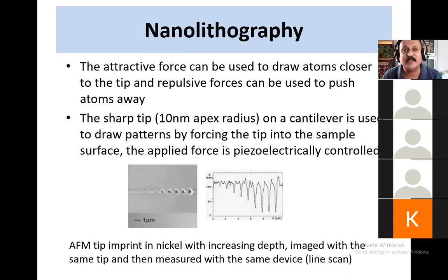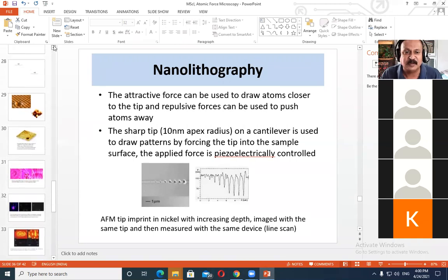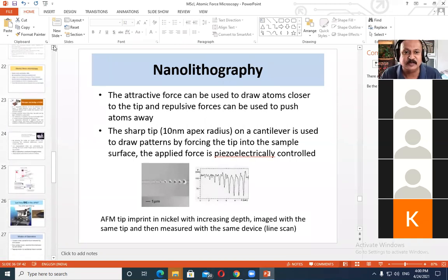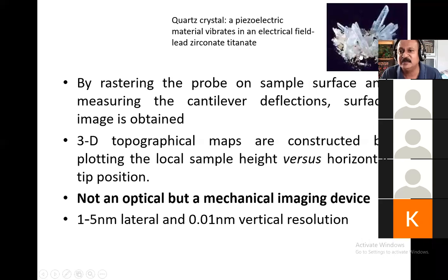Do you understand what I'm saying? So the movement of the cantilever is because of the piezoelectric properties of a material which is called a piezoelectric crystal. Is it right? I think I had that image somewhere in my presentation. Shall I go a bit backwards? I'll just try to show it to you. Yeah, here it is. I'll increase that size. Can you see this one?